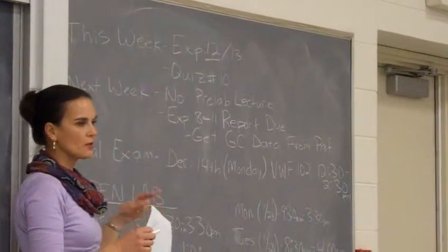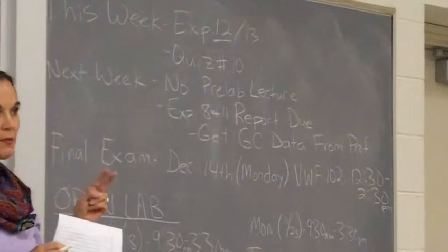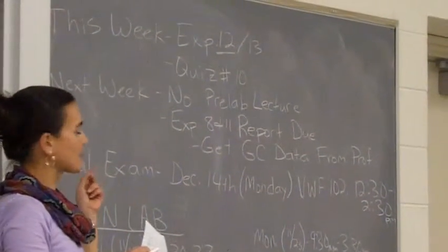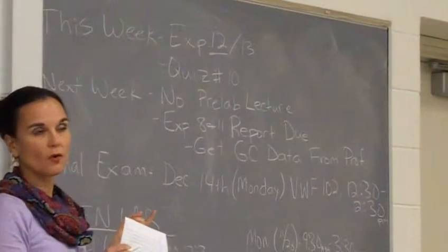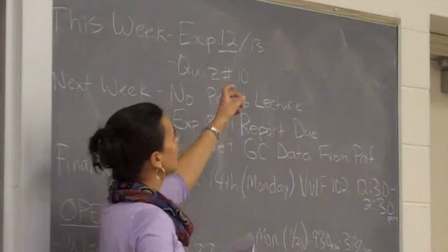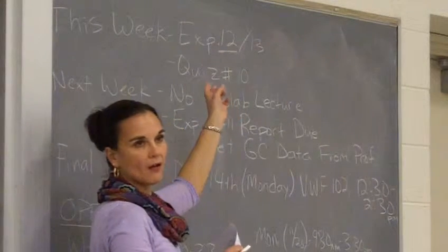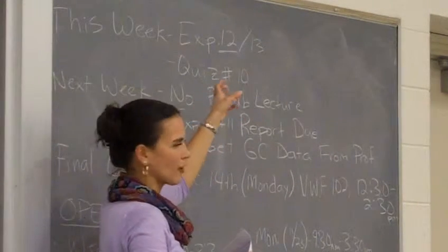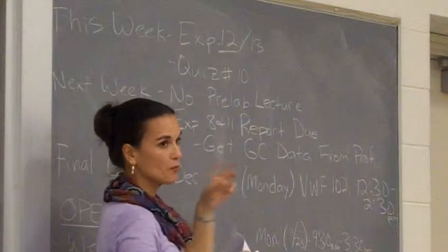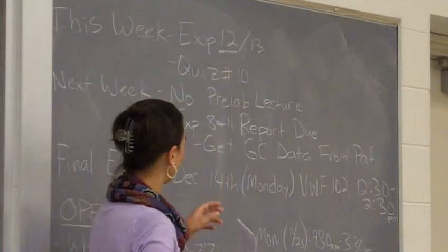This week in lab, on your syllabus, it's another week where you have 2 experiments listed. The doing in lab, for the most part, is experiment 12, the reaction you're going to run, and what you should pre-lab is experiment 12. Experiment 13 will teach you about thin layer chromatography. So there are some diagrams and so forth that you should take out of experiment 13, but for the most part, your pre-lab should be about experiment 12.